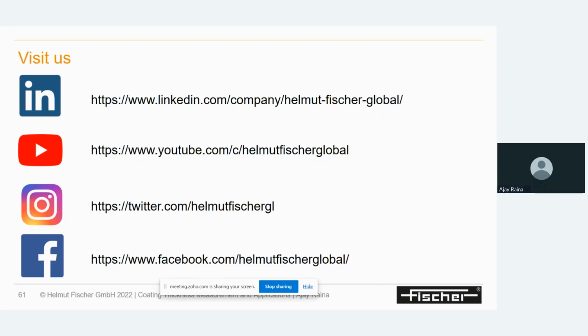Next question is from Mr. Sujit. Can you please share the difference between XRF analysis and chemical analysis on the basis of accuracy? Yeah, sure. I'll share that, because there are different methods for chemical analysis and how capable the XRF machine is based on accuracy. I will share this with him, not an issue.